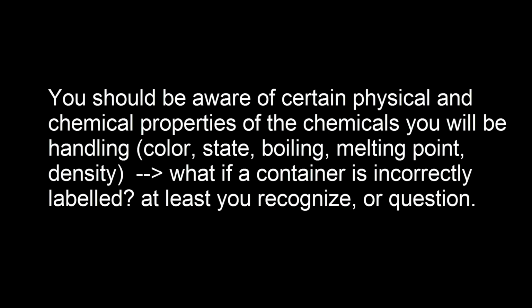Right, you've got to check out the properties, good and bad, of the chemicals you'll be using, at least the boiling point, melting point, density. We are chemists.